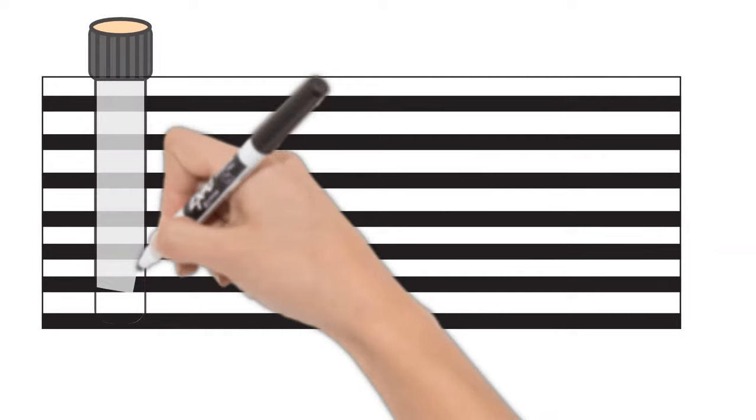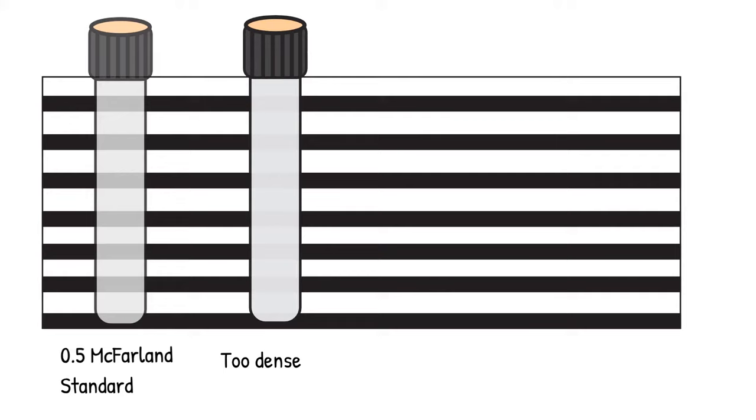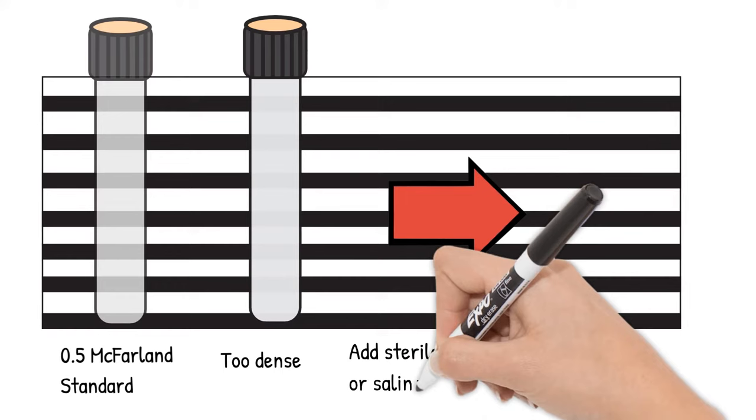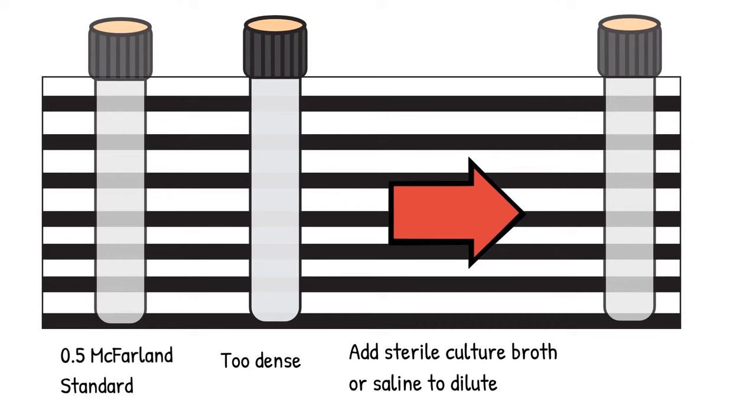If the suspension is too dense, it would be more difficult to see the lines through the bacteria suspension than through the 0.5 McFarland standard. In this case, you can either add sterile culture broth or saline to dilute the bacteria suspension until the turbidity is the same level.